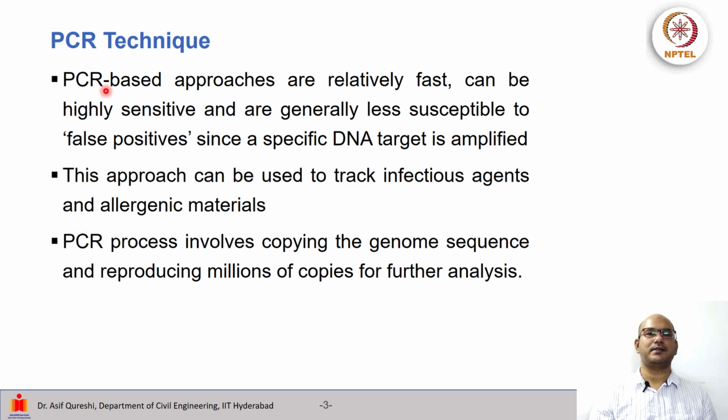In general, PCR based approaches are relatively fast and potentially can be highly sensitive and could be less susceptible to false positives, since we are targeting a specific DNA. As with other applications, PCR based techniques can be used to track infectious agents and allergenic materials.